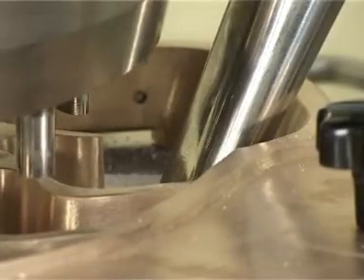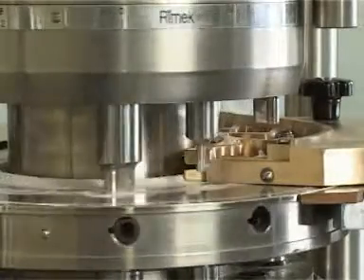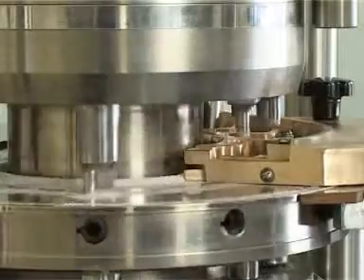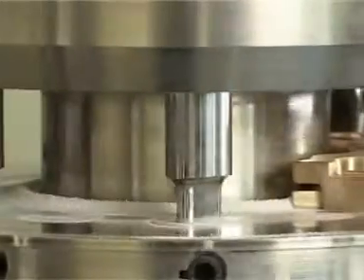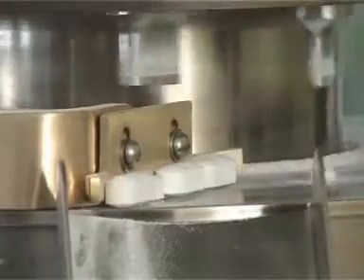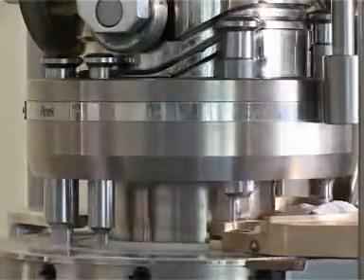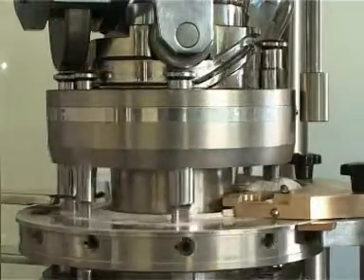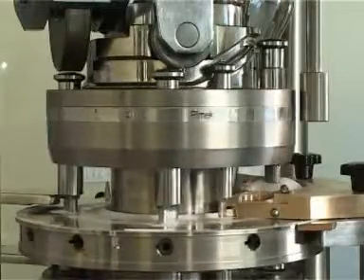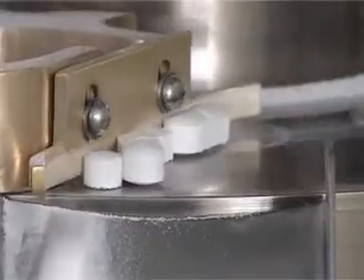The powder flows from the hopper to the gravity feed frame or force feeder to fill the die cavities. The die cavities will be filled as per the tablet weight set by an operator with the weight adjustment assembly. The extra powder not filled by the die cavity will be scraped out by a scraper plate and circulated to the turret inner face, returning to the feed frame after completing the rotation. The filled die will go through pre-compression for the necessary pre-thickness. Subsequently, the pre-compressed tablet will pass through main compression to achieve the final thickness. The final tablet after main compression will be ejected and collected outside the machine.